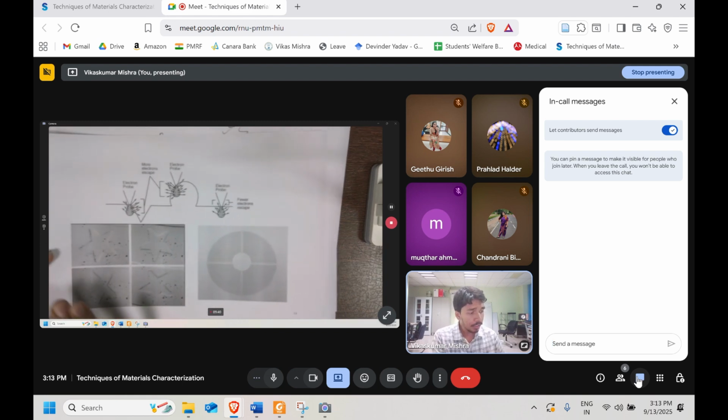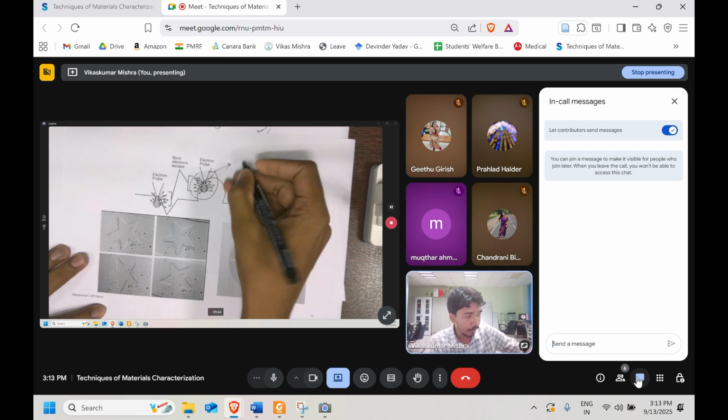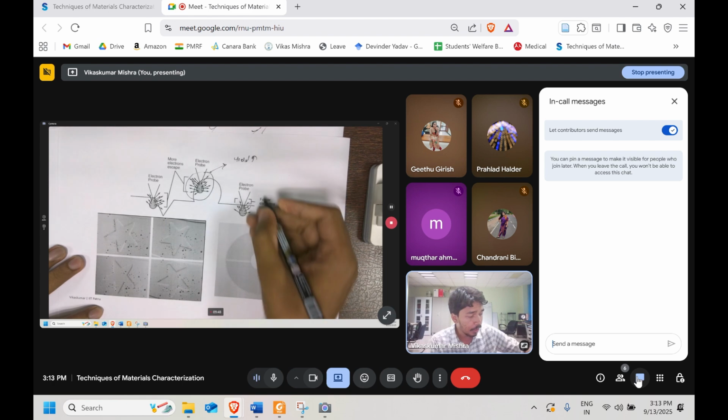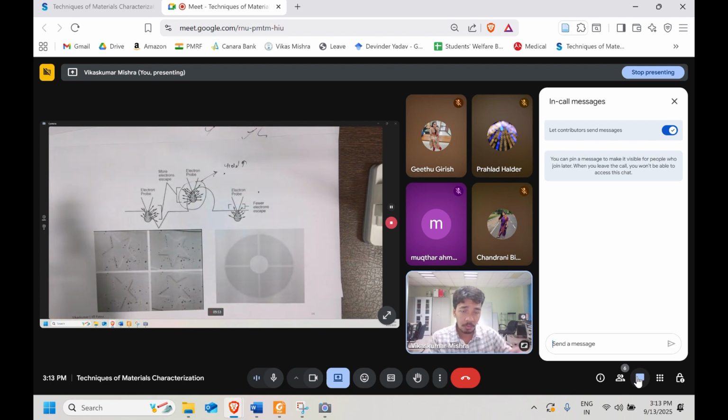So it's like the number of yield. Here the yield is not that much. Here the yield is more. By tilting, you can make the number of electrons, the number of signals coming out, more significant.